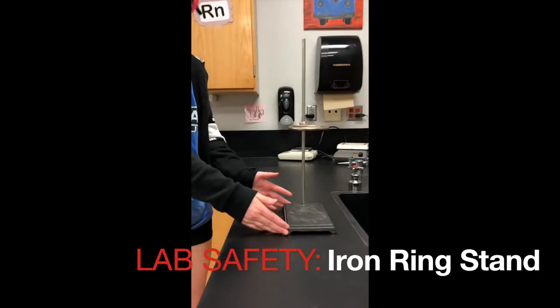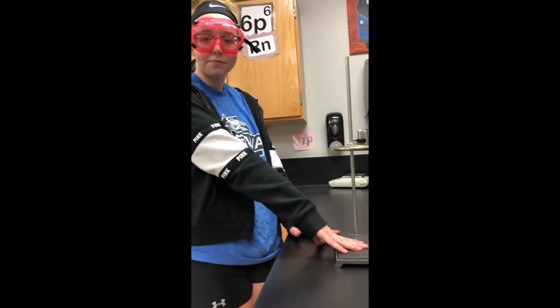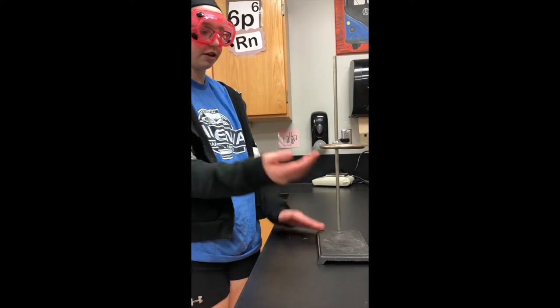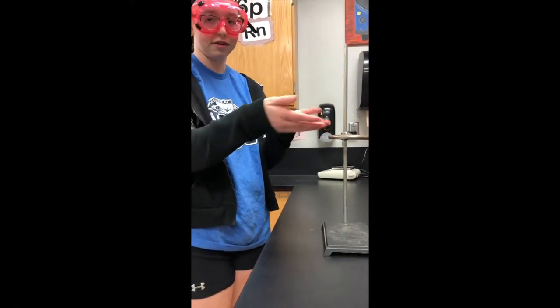This is an iron ring stand. How to use it? You would put the Bunsen burner on the platform right here, and it's used so we don't burn our hands trying to heat things up.